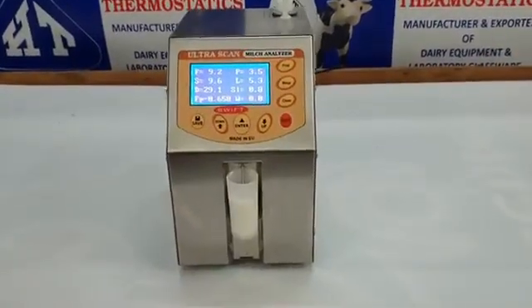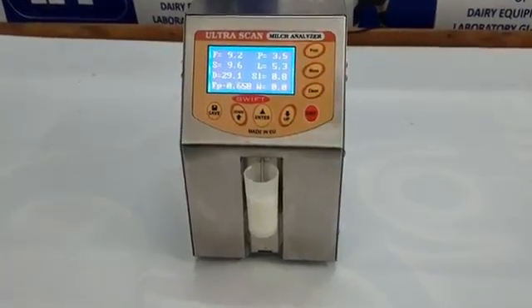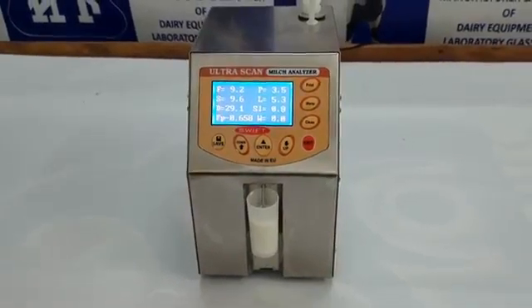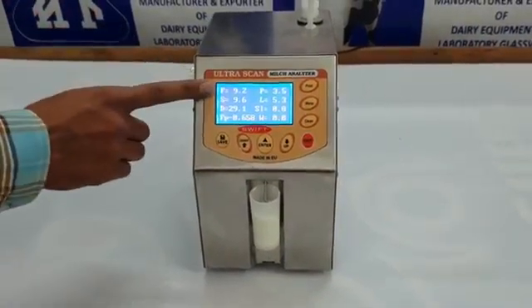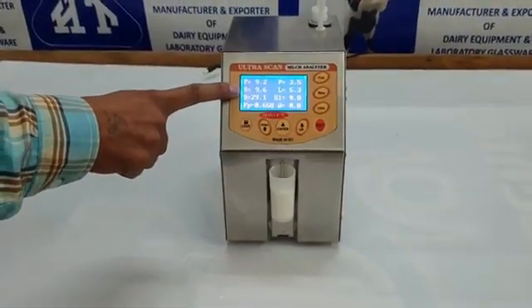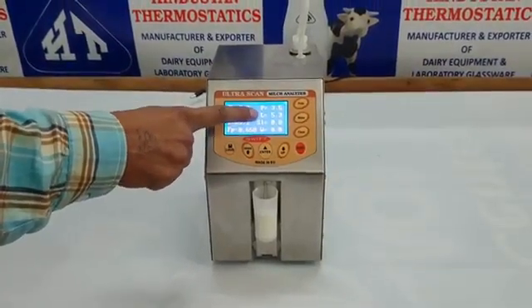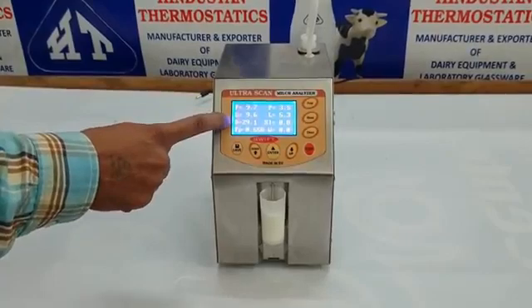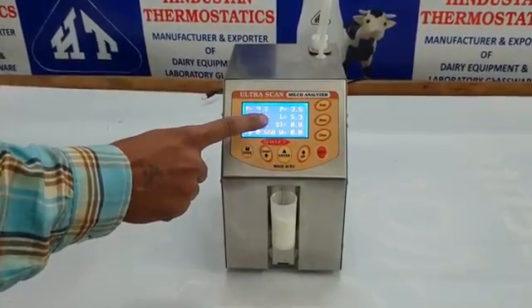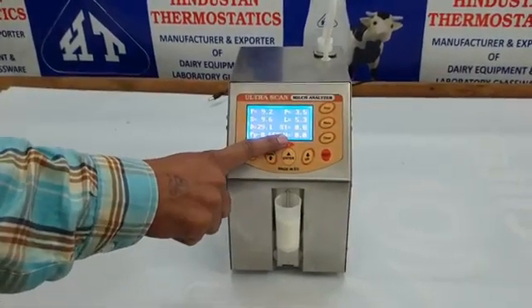All nine parameters of the tested milk sample appear on a single screen with bold, legible characters. F stands for Fat, S stands for SNF, P stands for Protein, L stands for Lactose, D stands for Density, SL stands for Added Salts, FP stands for Freezing Point, and W stands for Added Water.